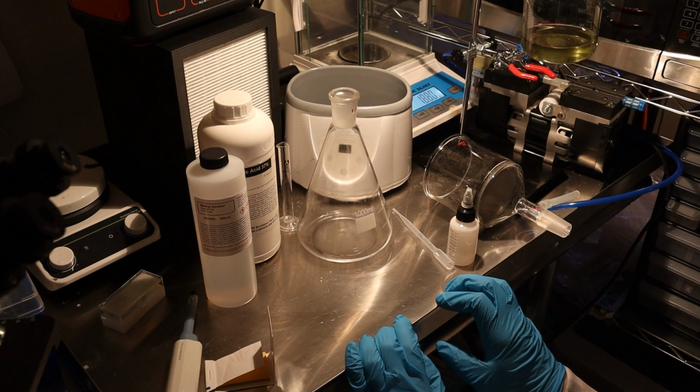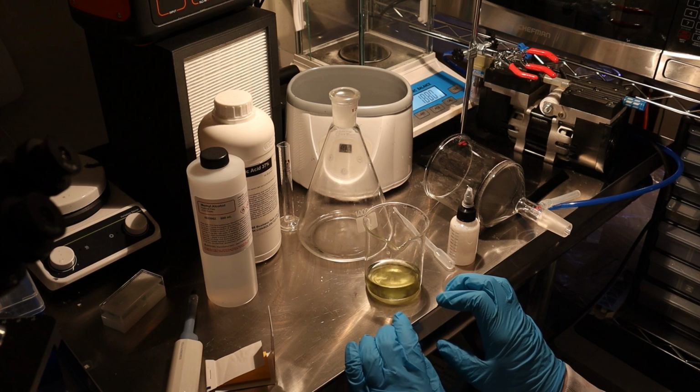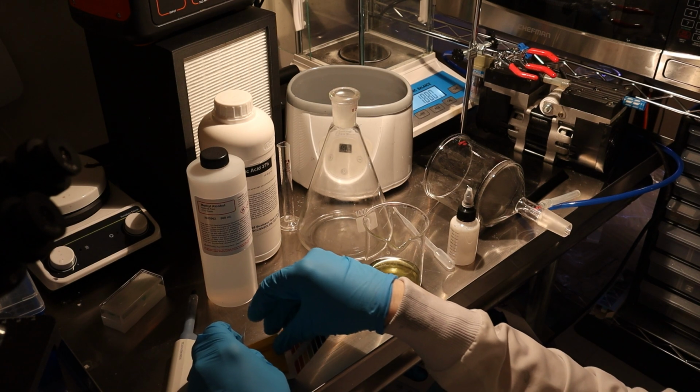I first had to neutralize the acid though, which I let a friend do, if you're wondering why their hair is brown. No! It's fine. I'm gonna filter it when we're done. Let's just see what it is anyway. Yeah, I'll filter it, don't worry.